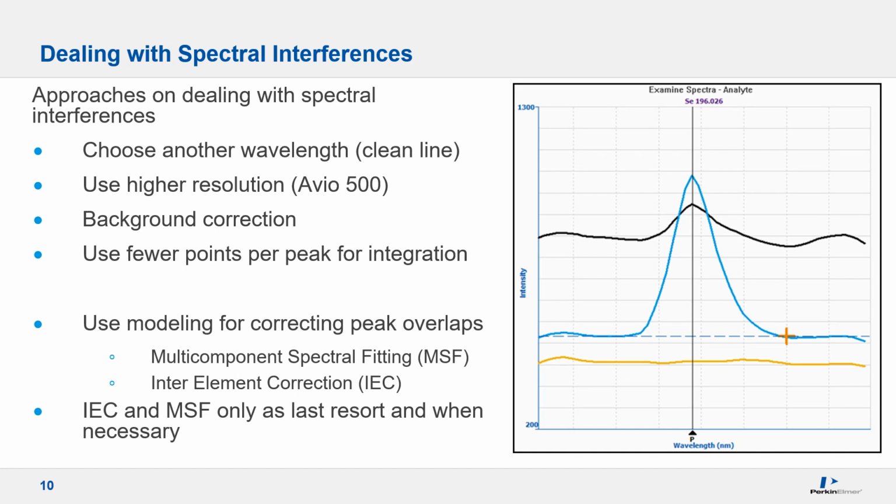Another option is to use background correction. The spectra displayed is for selenium with a clear background shift. In this instance, no correction model needs to be built, as the single point background correction will be sufficient to correct for the background shift.